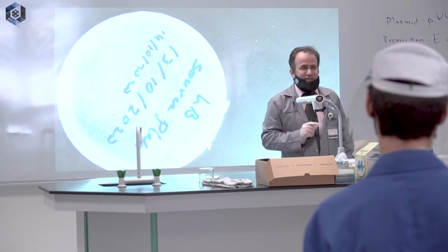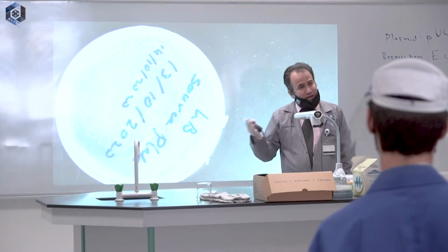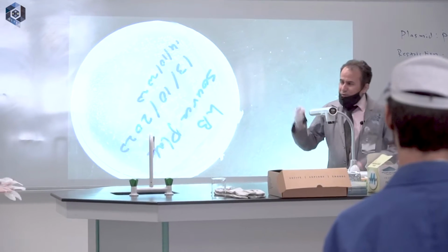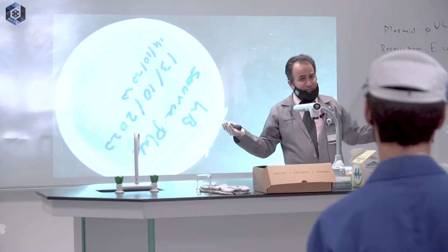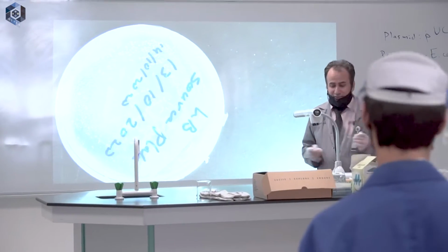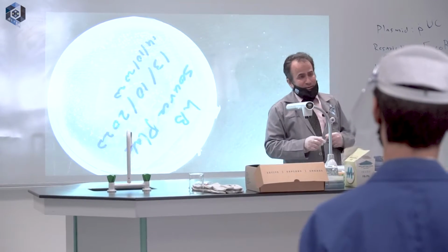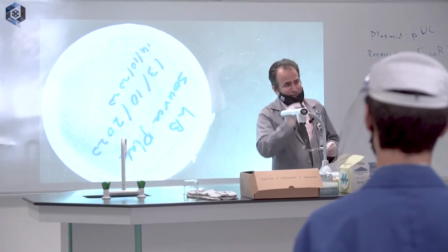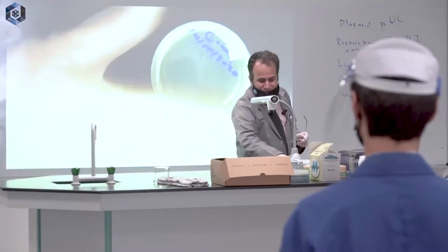What is the term? We will add the recombinant plasmid, the gene. What do we call this process? Transformation. We will transform them with what? With the recombinant plasmid. Now, I also took some bacteria and plated them on this other plate.